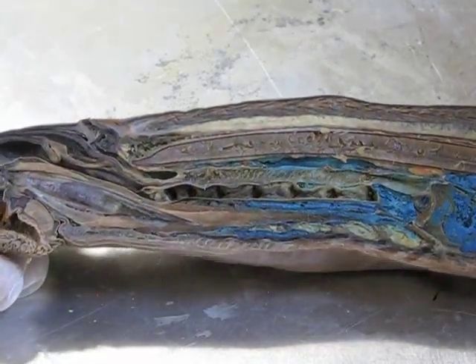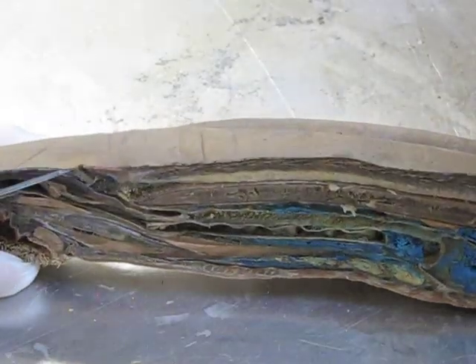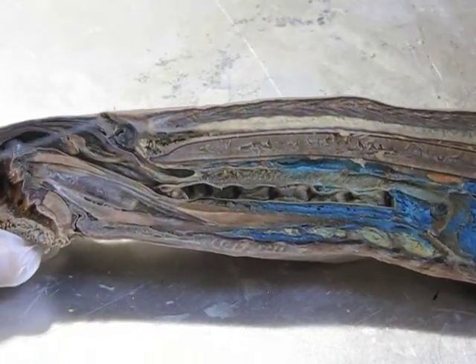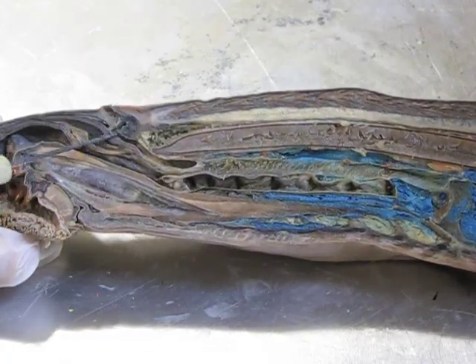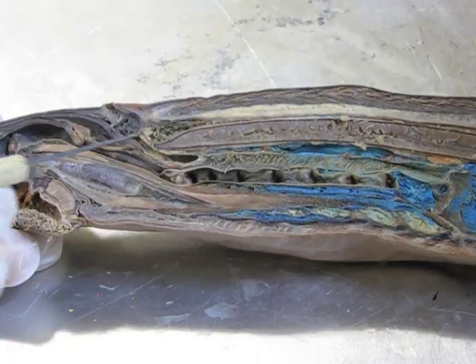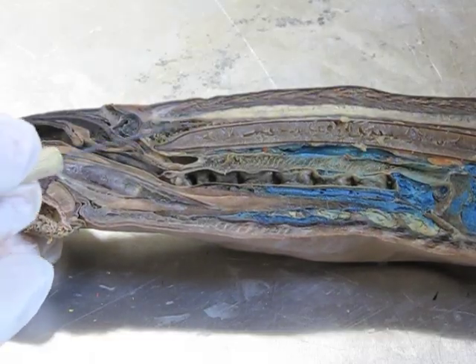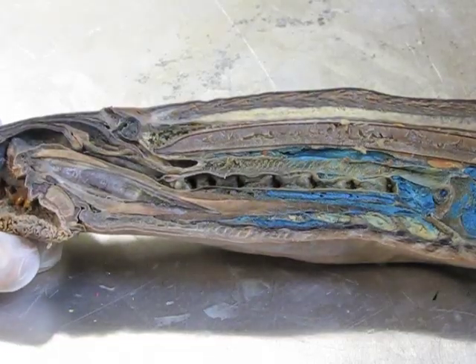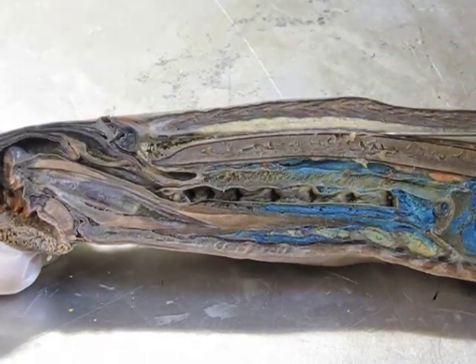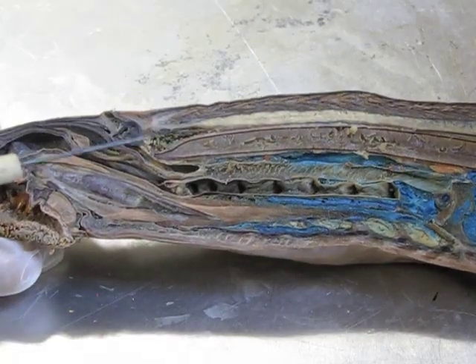Looking at the sensory structures: the nostril seen on the outside opens into the olfactory bulb — the roundish structure here — which is where smelling takes place. Closely associated with this is the brain, located in this little oval region. The brain narrows down into a tiny channel running the length of the animal, which is the spinal cord. So this animal clearly has a central nervous system with a brain located at the anterior end.